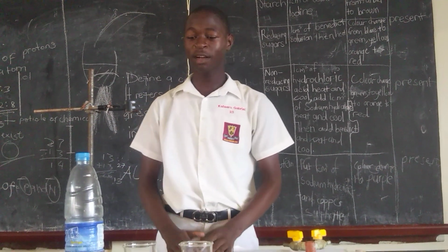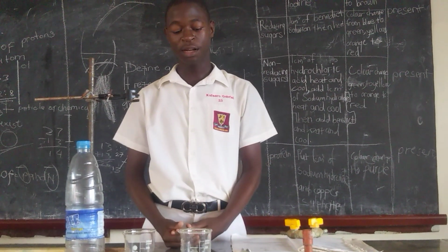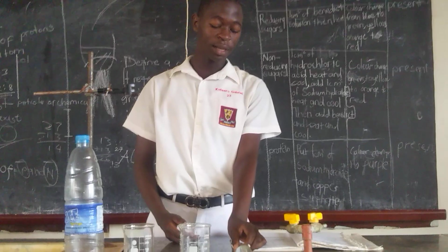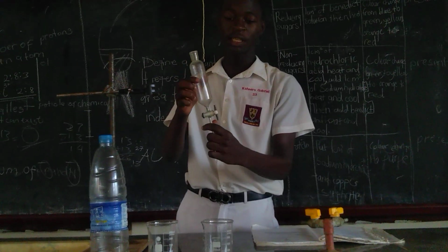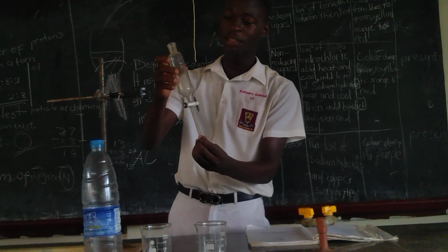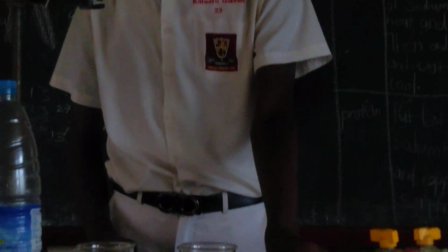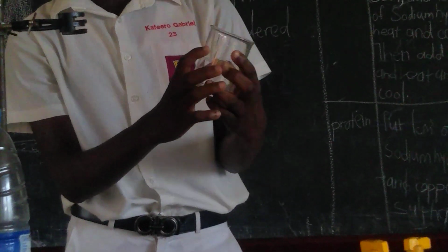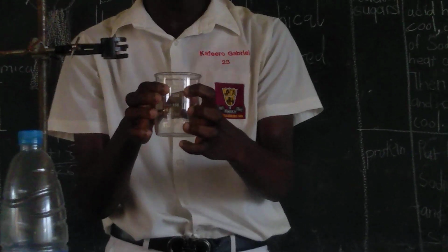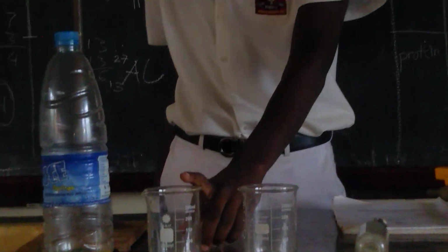Today I've come here, and you see the different apparatus in front of us. We have a separating funnel, right here. Our next apparatus is a beaker, a 250 milliliter beaker. As well, we have a second beaker.